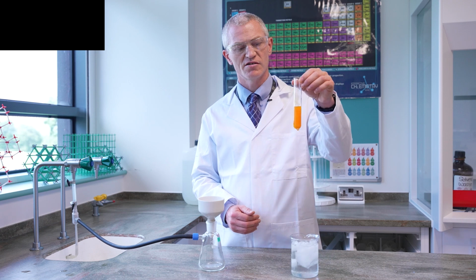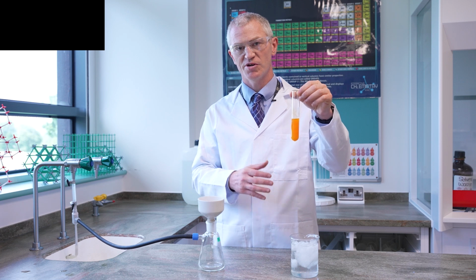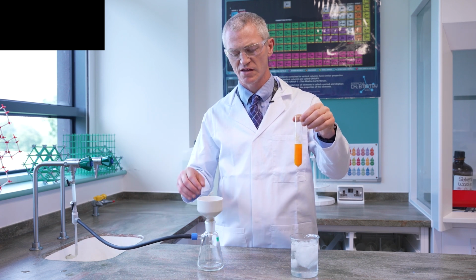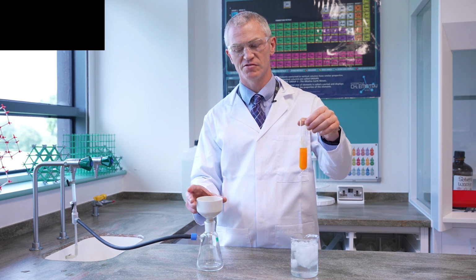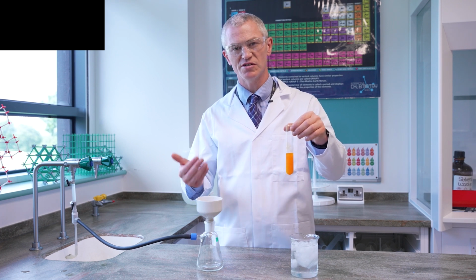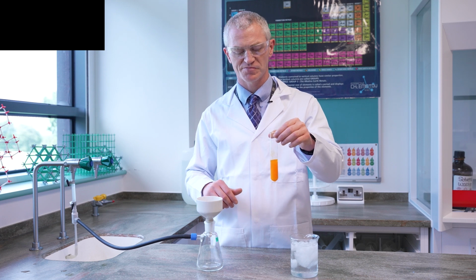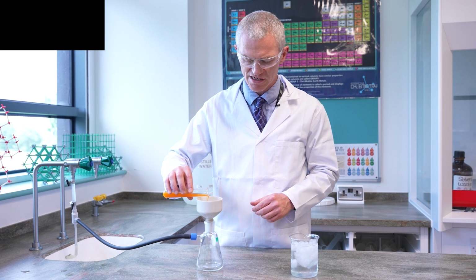So we have our recrystallized pure solid with our impurities in the liquid, and we're going to perform filtration. Filtration is done via a vacuum trap which is attached to a water tap. We have a Buchner flask, which is the bottom here, and a Buchner funnel, which is here. Then I have a filter paper on top, and what students mostly get wrong when doing this is they pour it in too quickly and then the solids go around the edge of the paper. So what you've got to do is pour it slowly and pour it down the center.